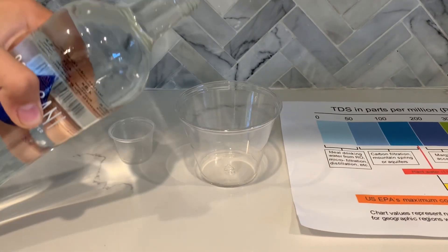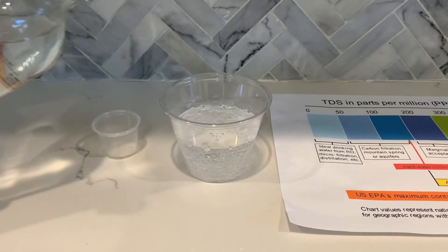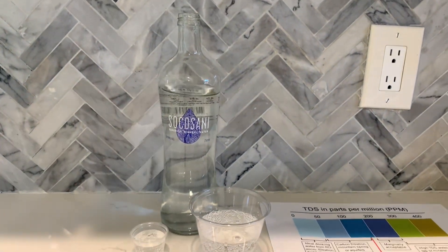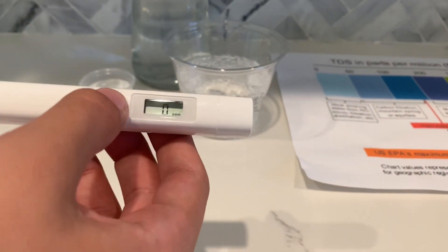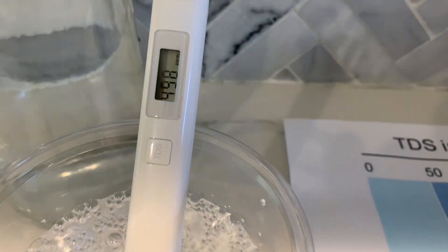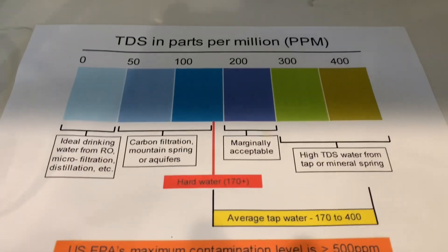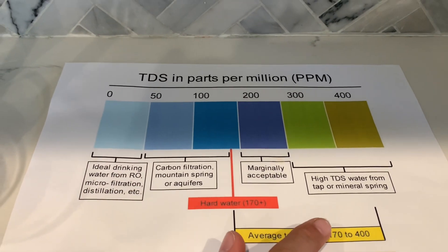Let's pour some water in. First, let's test the TDS level. Turn on the TDS Tester, make sure it says 0, and put it in. It's around the 400s, which is hard water with a high TDS mineral content.